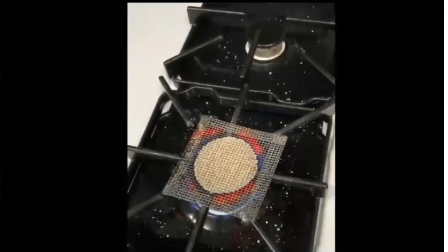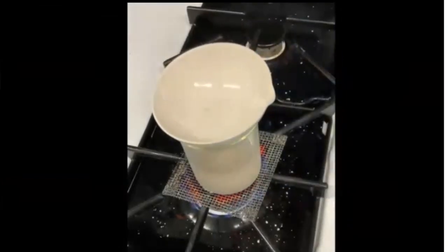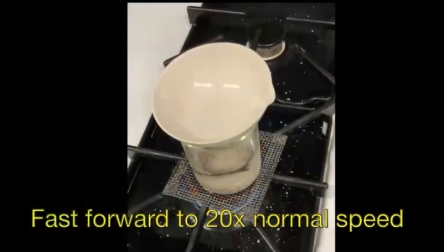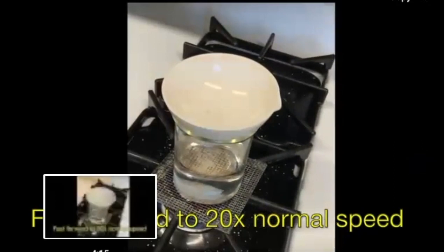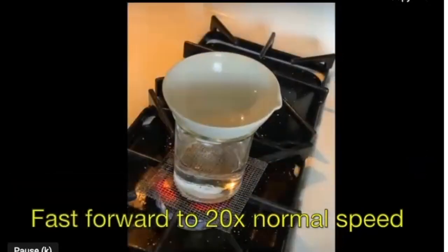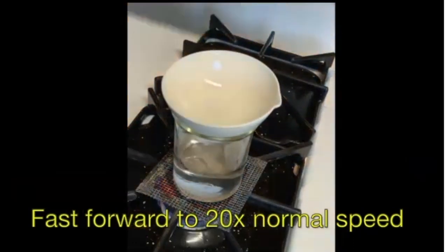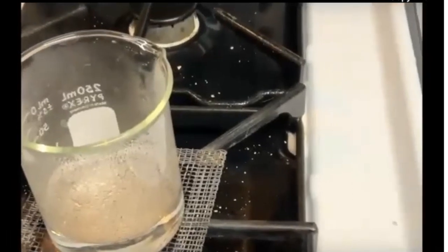Here I'm using my stove top. If you have a new wire mesh, it's going to crackle and these things are going to fly off. Don't worry, that's just some residue. And then what I've done in the video is I've fast forwarded these things so that you don't have to wait 20 minutes for these things to boil. So if you just let it play in real time in the video, it actually is going 20 times the normal speed. Okay. So I'm just taking the video and speeding it up as I edit it. And you can, of course, scrub through and get to the point that is important.